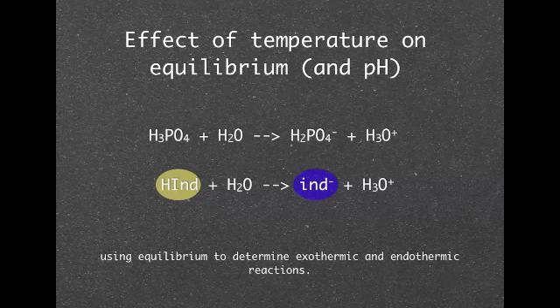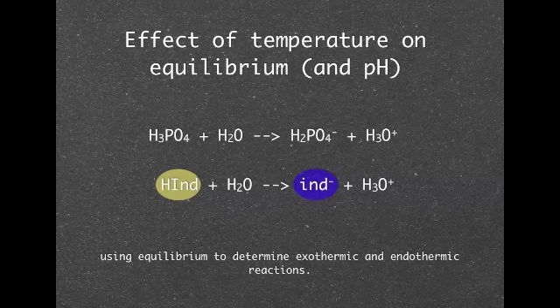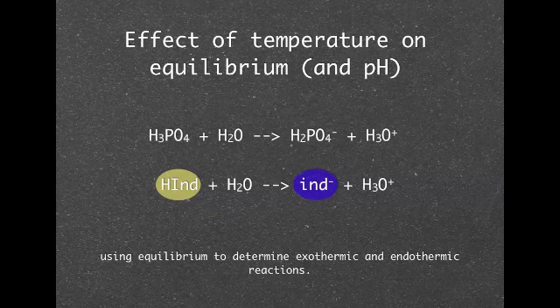Alright, another equilibrium demonstration. This time it's due to the equilibrium of an acid dissociating and looking at how this dissociation is affected by the temperature.